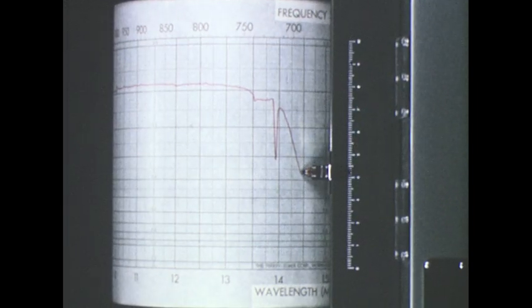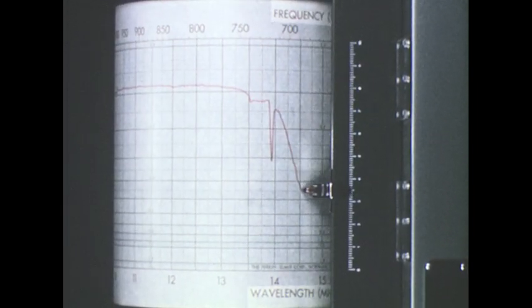This is the bending frequency vibration. As in the case of the unsymmetrical stretching vibration, there is a dipole moment produced. An infrared band occurs, but at a lower frequency.